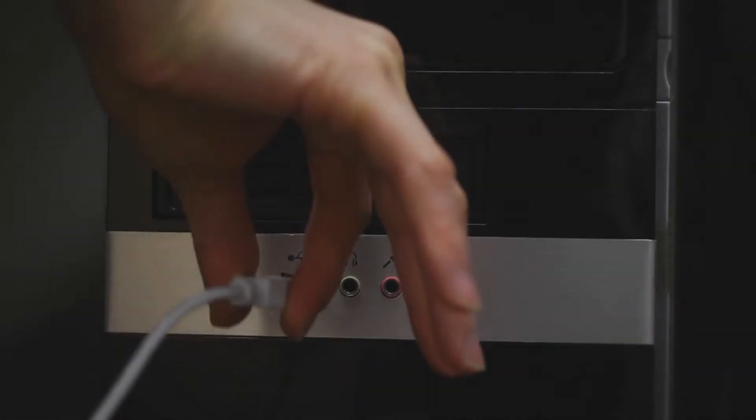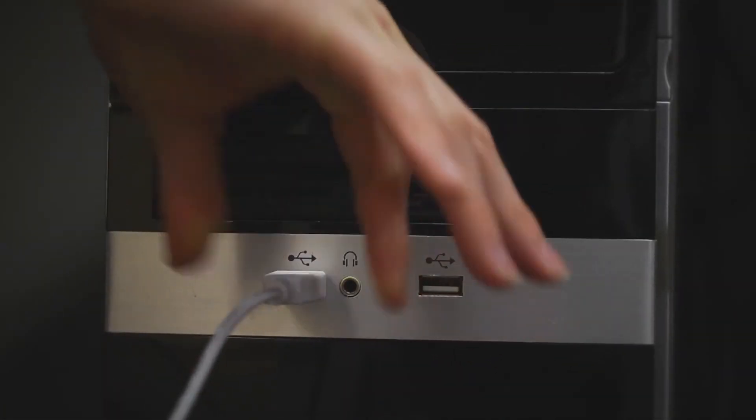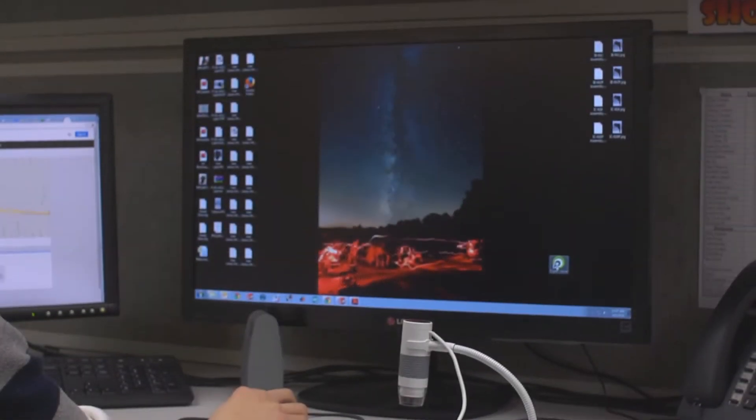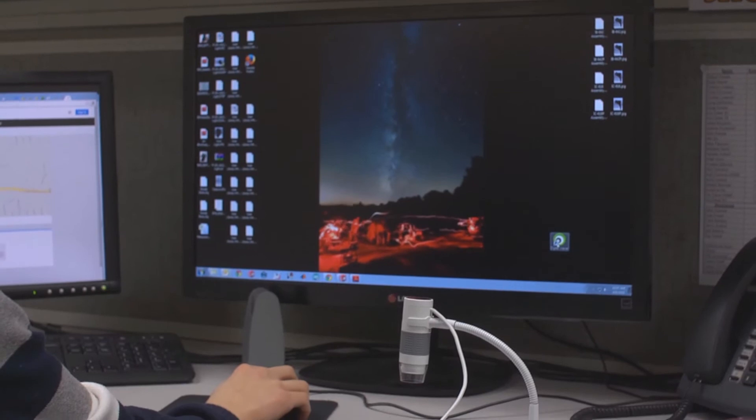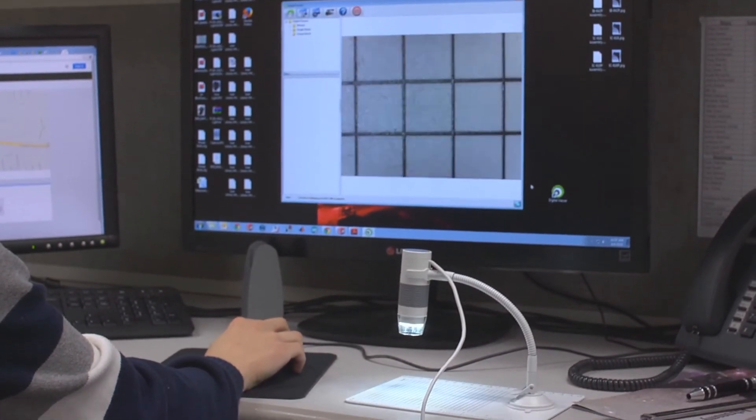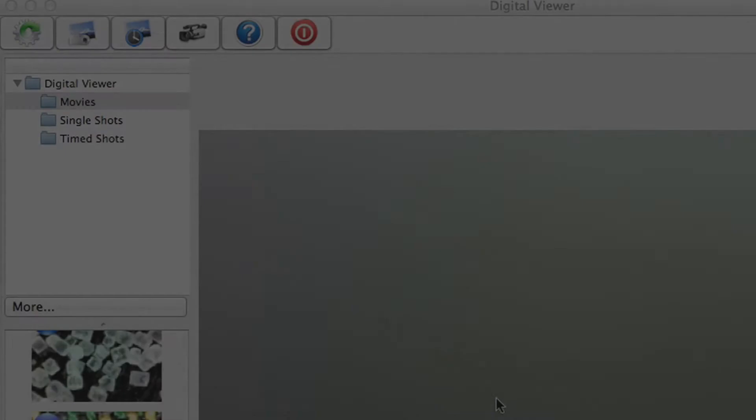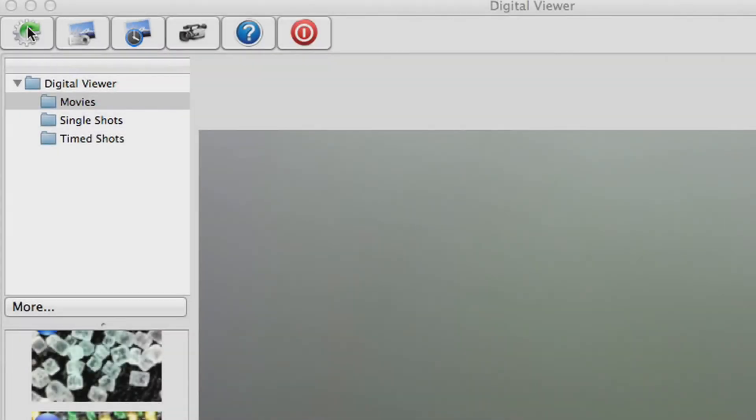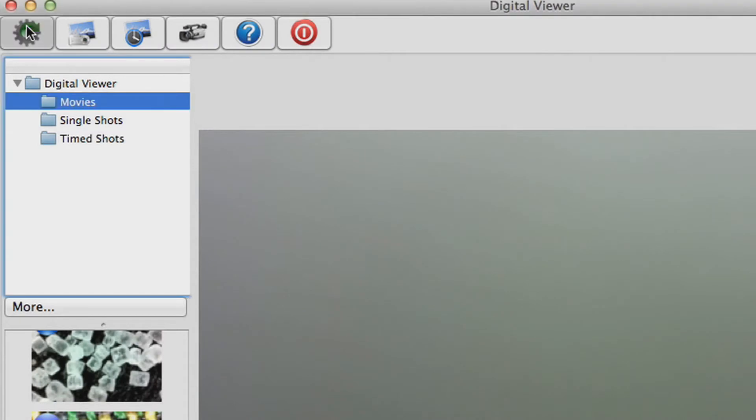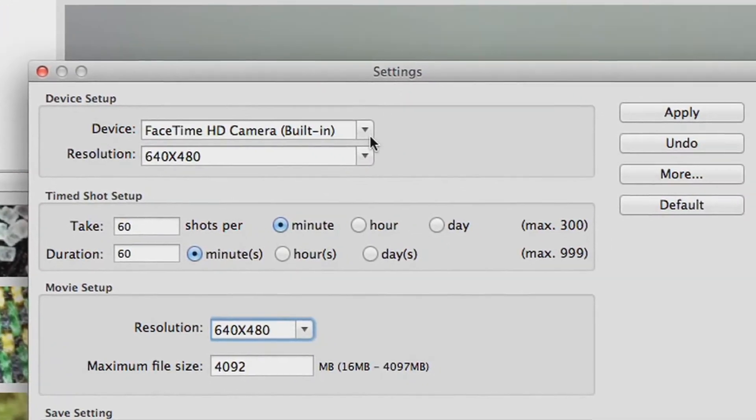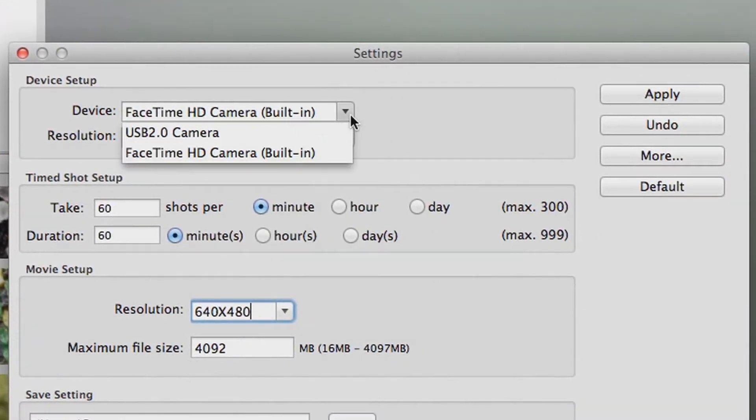The eFlex plugs right into your USB port. When you open the software, the eFlex will automatically be activated. If not, just click the settings tab, go to devices, and select the latest USB driver.